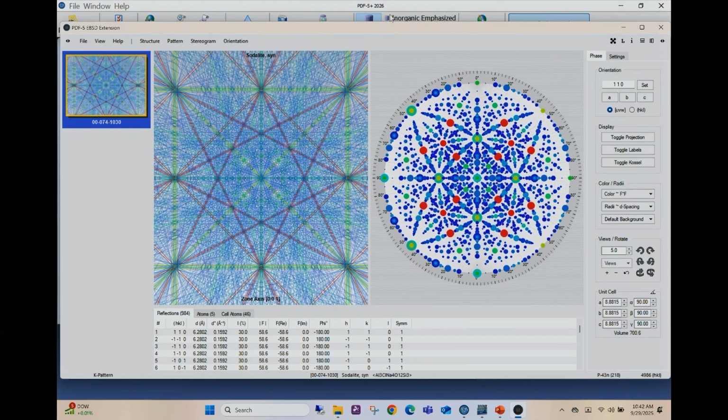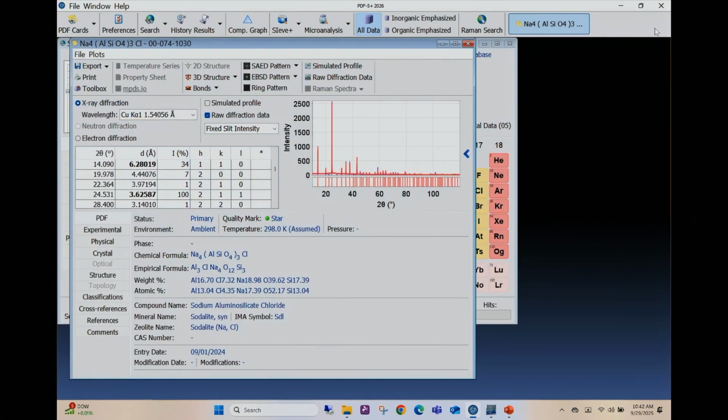Okay. So years ago, when someone said I was purchasing the powder diffraction file to do my phase ID on my material, that was correct. You had D-spacing, intensities, maybe HKLs if you knew the unit cell, maybe a little bit of extra data in there, but now, of course, with it being in an electronic format, it's expanded in its capabilities. A couple of things just to pay attention to.